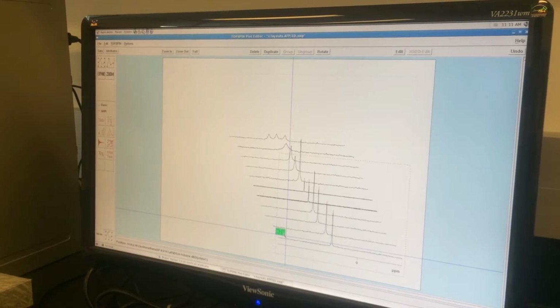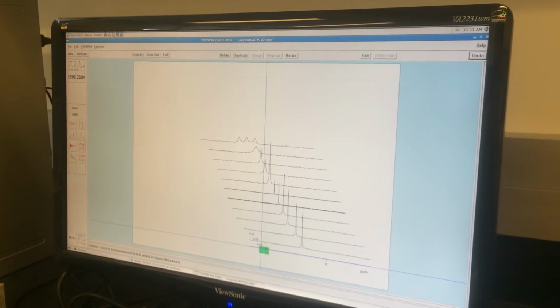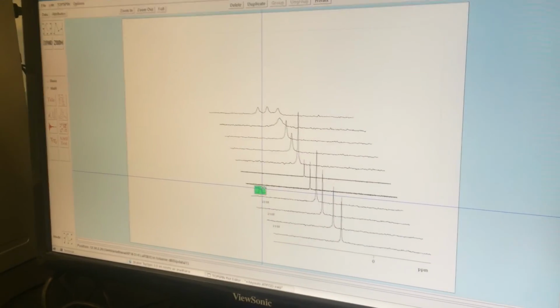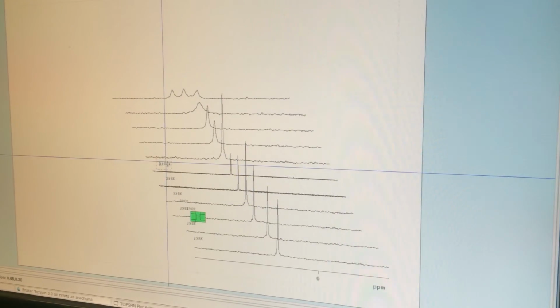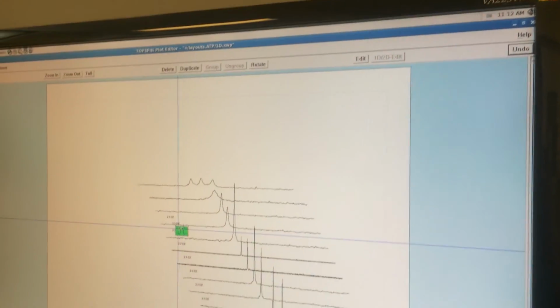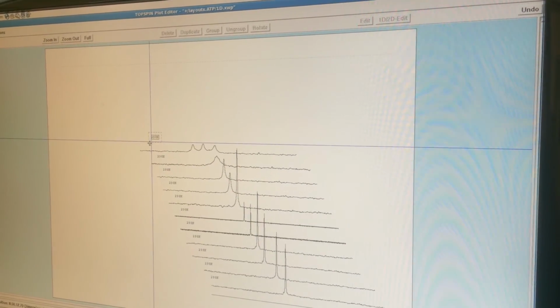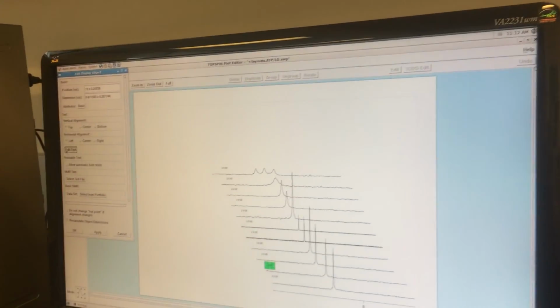And then to do the same thing, you can either type at every temperature, or you can just duplicate the temperatures and just arrange them. Now you can go to each of these numbers individually and edit the temperature.